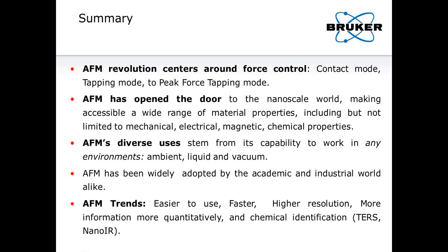Thank you. And related to the liquid samples, the question of what environment the AFM was operated in for the red blood cell. Do you know, was that done on the perfusion stage? You also showed the lithium battery. Was that done in liquid? Was that in the EC cell? So for the blood cell, actually, I don't know the detail there. It's done with PeakForce tapping mode. There is a liquid cell for that. I need to find out exactly which cell is used. I think it's a bio cell.